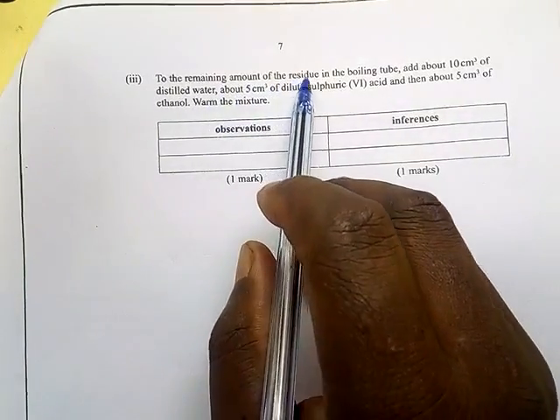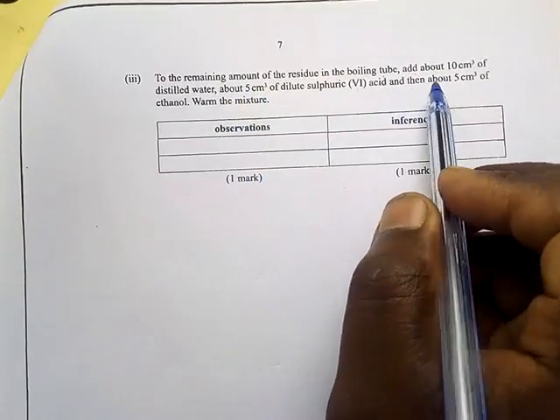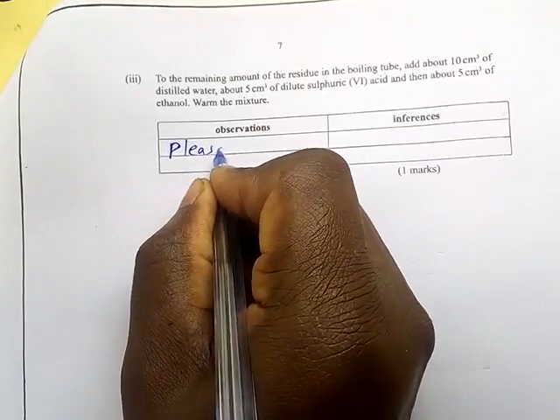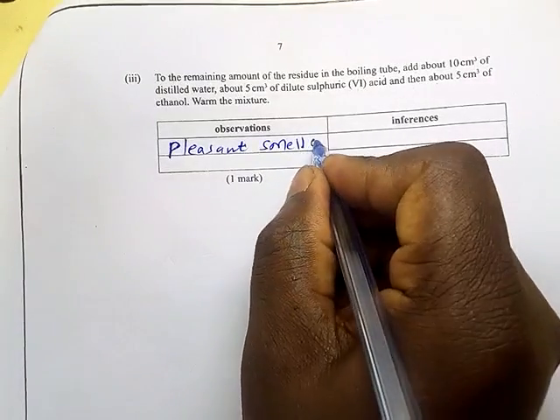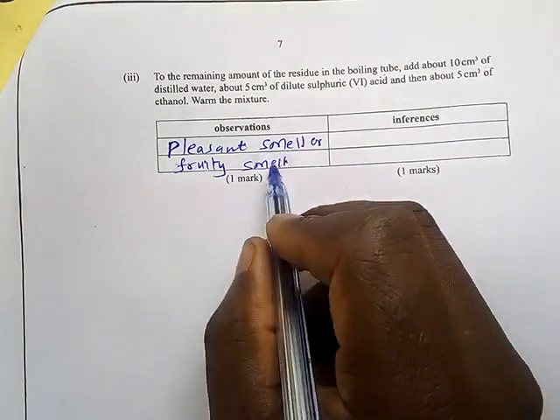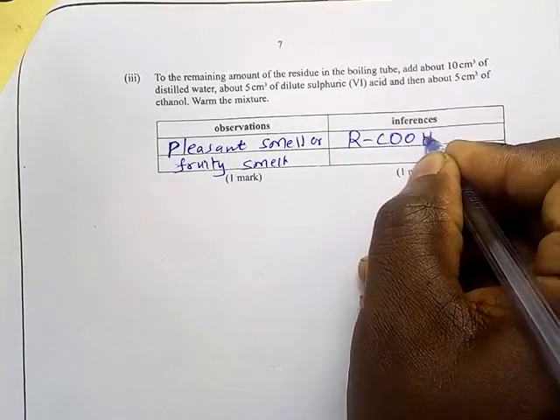To the remaining amount of the residue in a boiling tube, add about 10 centimeters cube of distilled water, about 5 centimeters of dilute sulfuric acid, and then about 5 centimeters of ethanol. Warm the mixture. Here we have a pleasant smell. So a pleasant smell was produced, or a fruit smell. If a fruit smell is produced like that pleasant smell, then it means that the RCOOH is also present.